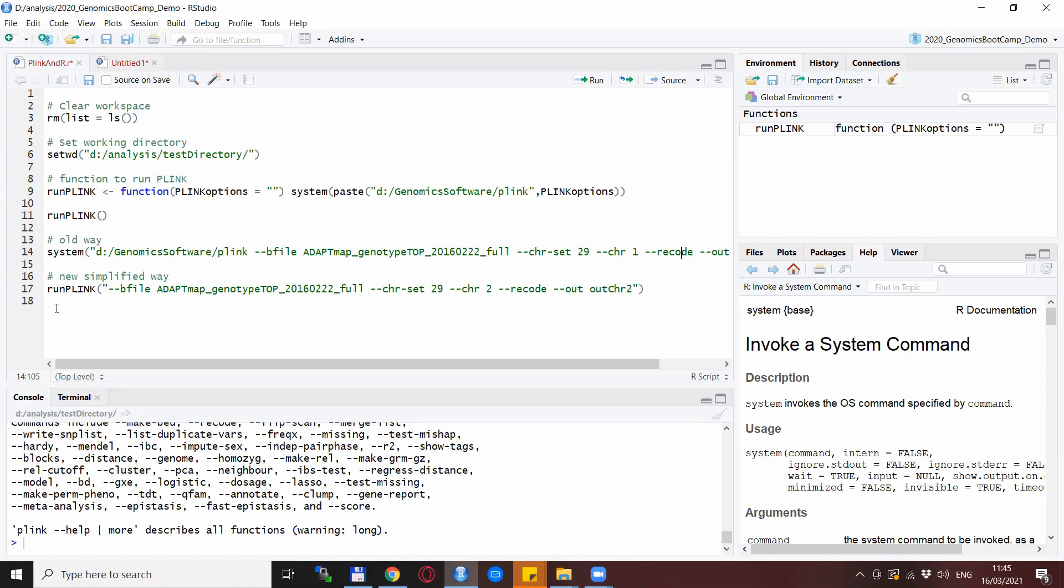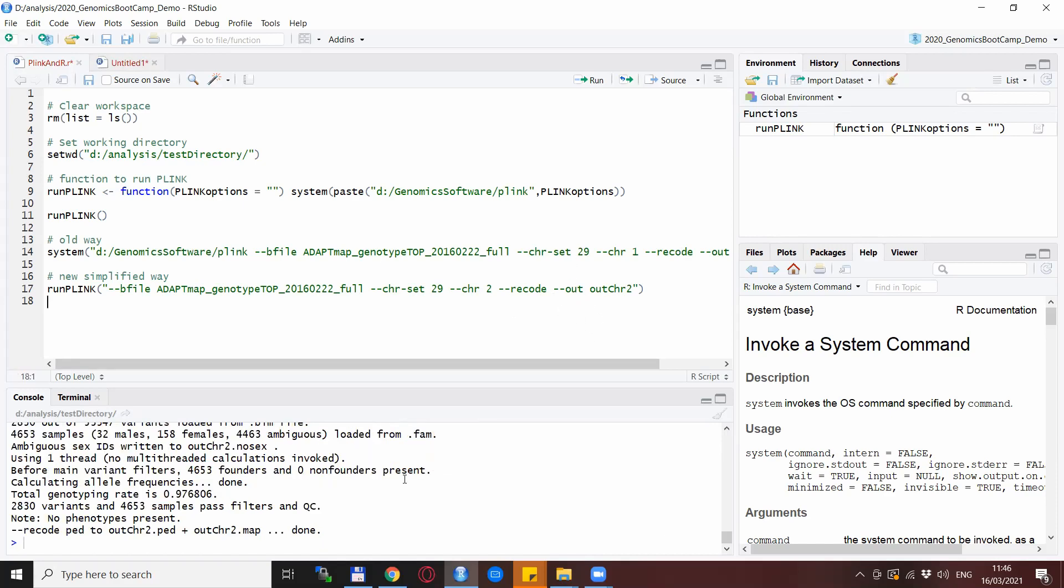Okay, so to follow up, you need to specify the function name runPlink, and then in the Plink options, you just need to put in everything that you would put otherwise after the Plink command. So just to make a bit of a difference from the previous run, I extract chromosome 2 here and also with a different output file to show that this works. And bam, the chromosome 2 is extracted.